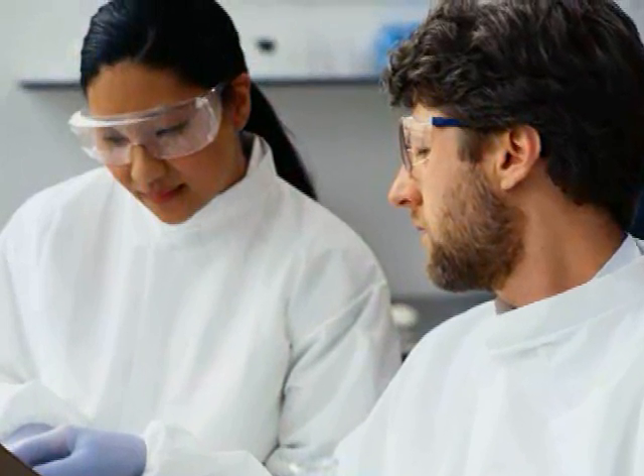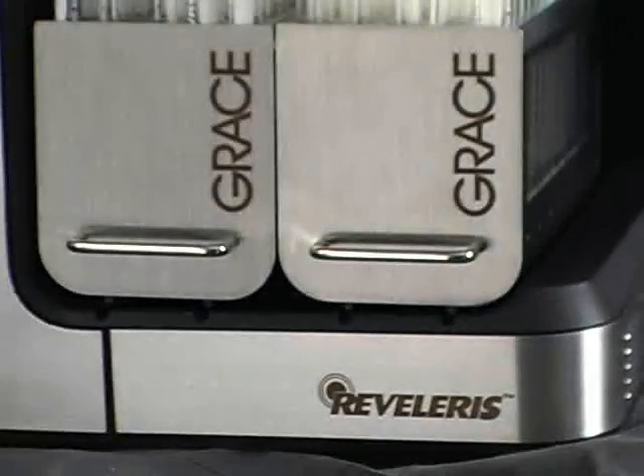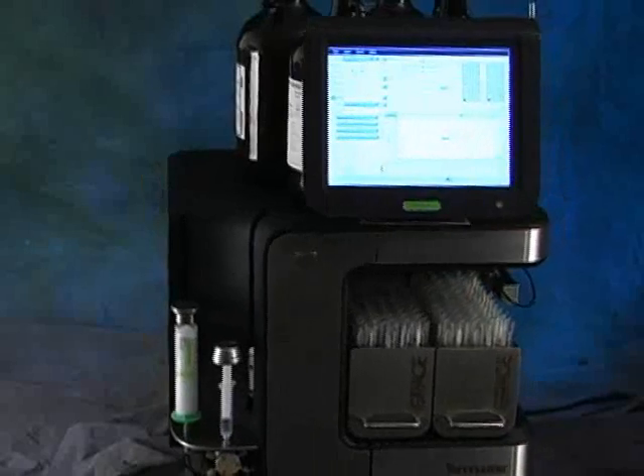Finally, the only flash system a chemist will ever need: the revolutionary new GRACE Reveleris system with RevealX technology.